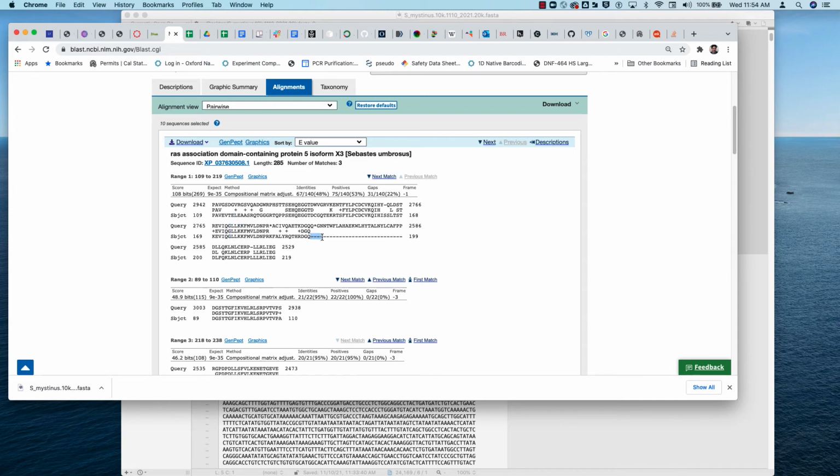And it also shows us regions that could be missing from the sequence. So for instance, it looks like there's a large deletion that's present in this organism but absent in the other. So it looks like we have a good match.